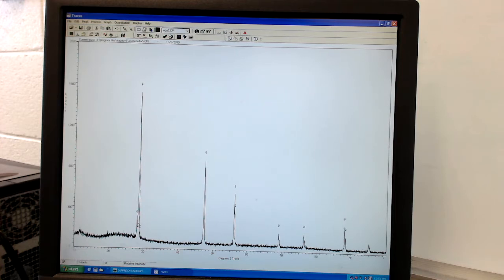You'll notice this little peak down here got picked up, this one, this one, this one, this one. If we want to add a peak, I can click there, and you'll see that that one popped up. I added another one. You'll notice I've added a lot. If you want to subtract a peak, you have to click right on top of it, so it can be kind of challenging. So what you can do is, I'm going to start over again.